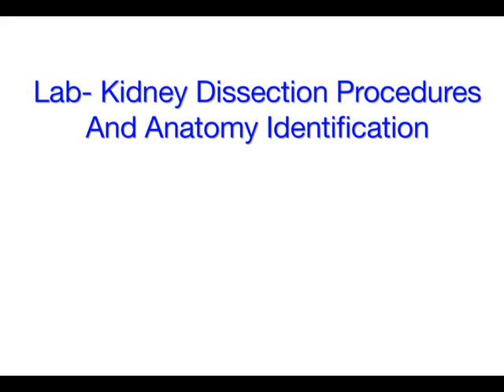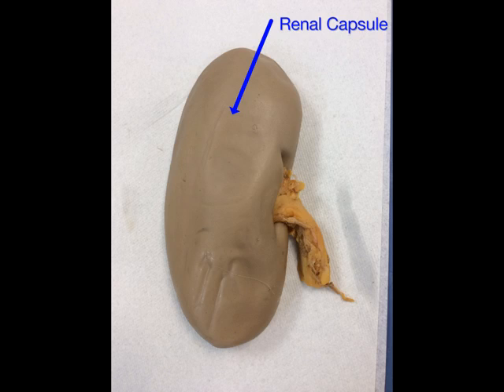In this lab, you'll be dissecting the kidney and making external and internal observations of anatomical structures. The first external structure you have to identify is the renal capsule, which is the outer covering of the kidney.